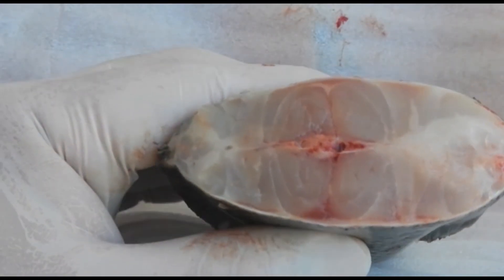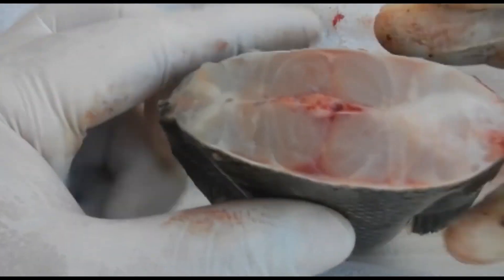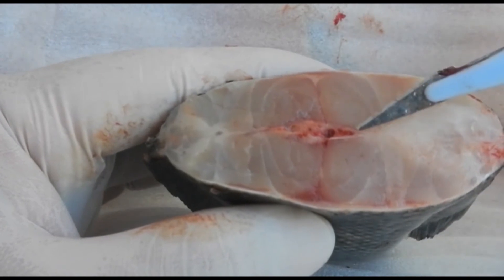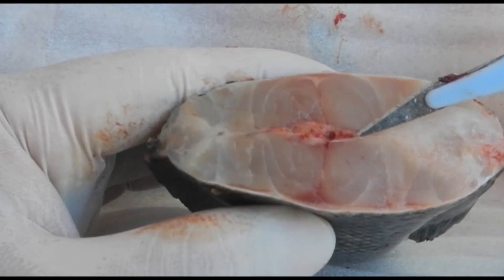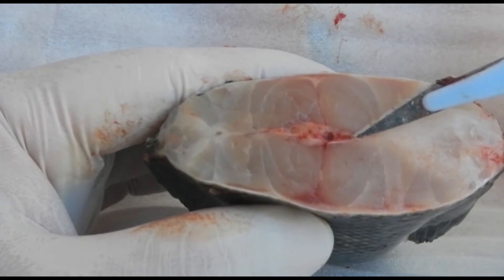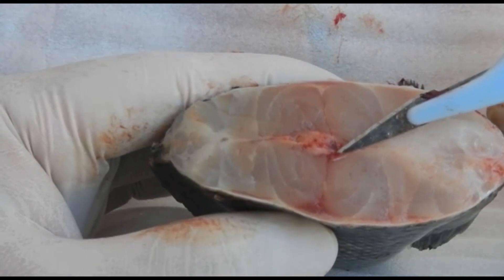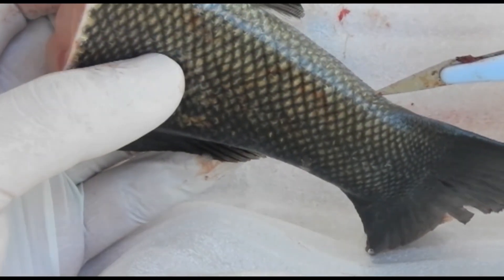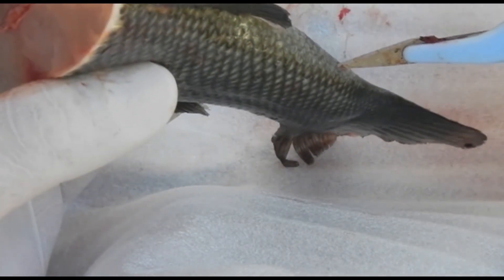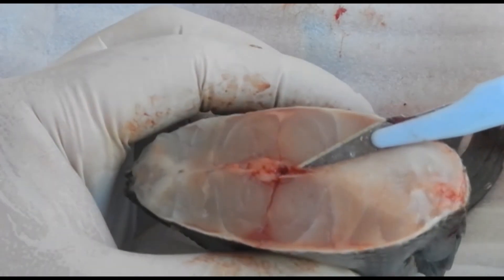What else you can see here is the haemal arch. When taking a caudal venipuncture, you'll be entering this tail vein right here, and above that is the tail artery. Of course when taking a blood sample it will be far more caudal — you insert the needle there and you'll be entering this blood vessel.